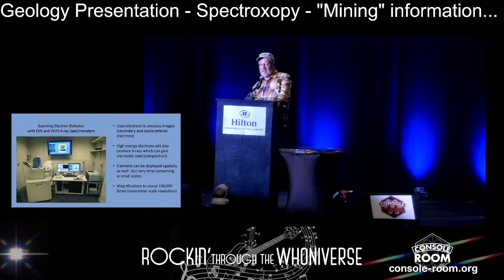The University of Minnesota has some of these transmission electron microscopes that are a couple of million dollars. Those are separate from the building. They actually pour a concrete base, set the instrument on that, and separate it from the building. You have to step on the instrument to load it, and then you step off it to run it. That's not the case for this. The scales of things that we look at are generally millimeter to micron scale, so it works for us. This one is going to go off service contract soon. We're going to have to think about replacing this at some point too.